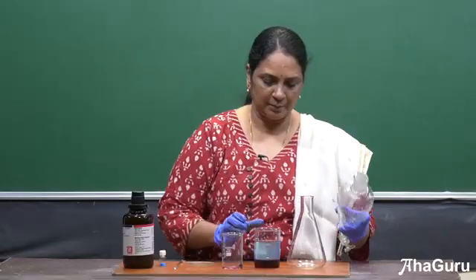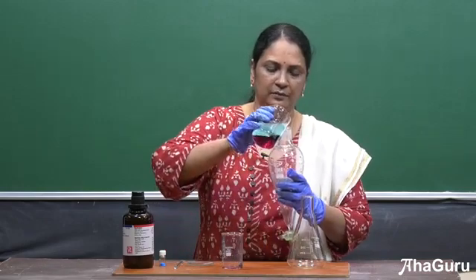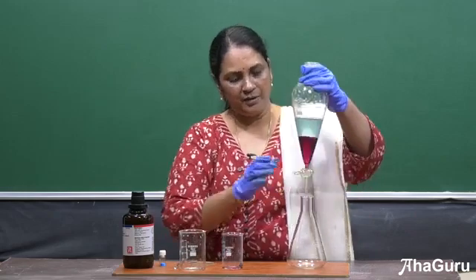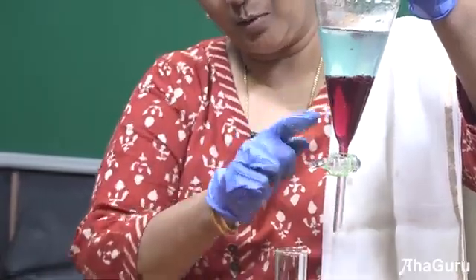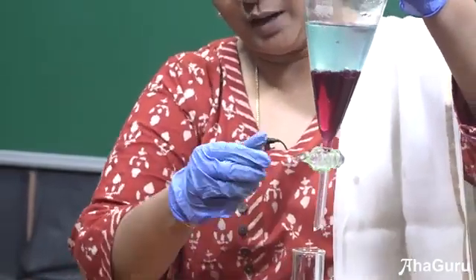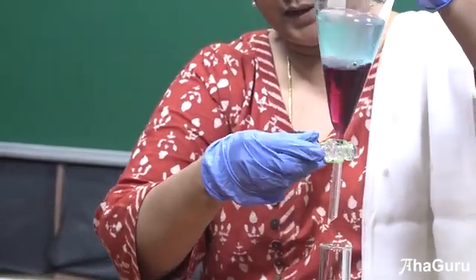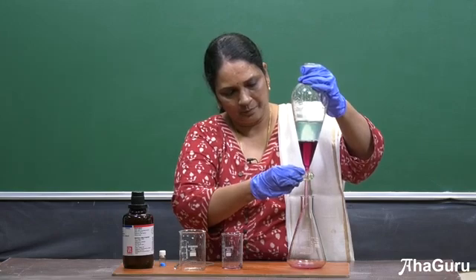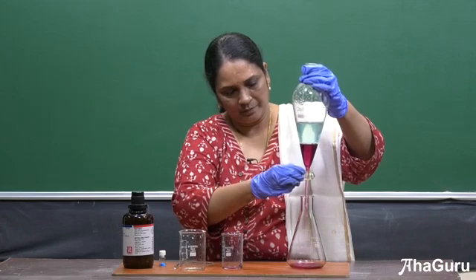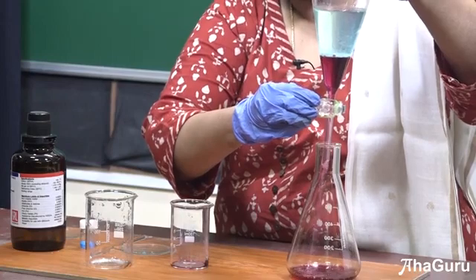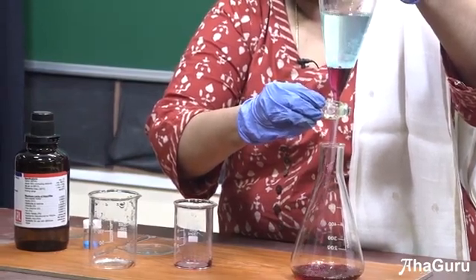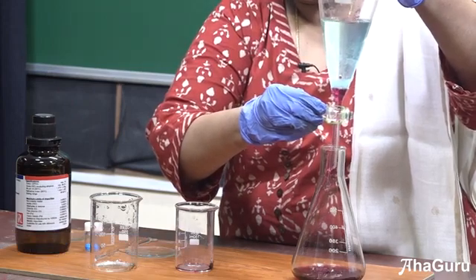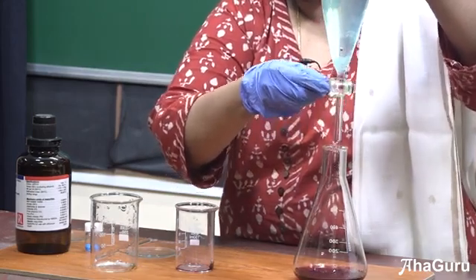Now how do I separate it? Use a separating funnel — transfer this into the separating funnel. Now you can separate the bottom layer, that is chloroform and iodine, as these two are completely non-polar. Slowly shake it so that they mix completely and then remove the bottom layer slowly. This experiment proves like dissolves like — polar will be soluble in polar solvent and non-polar compound will be soluble in non-polar solvent. Be a little careful so that they don't mix. I have now separated out these two using a separating funnel.